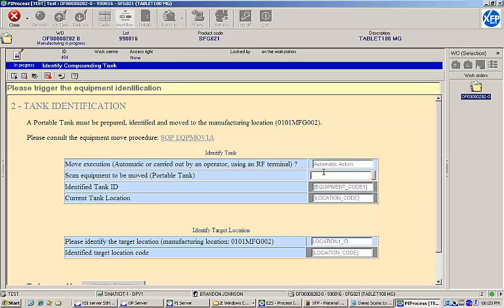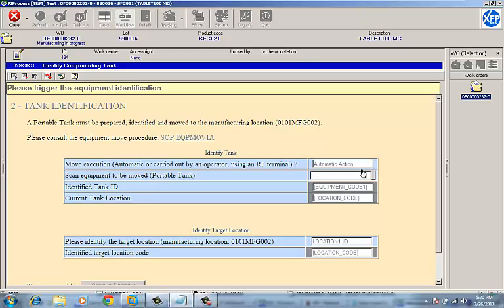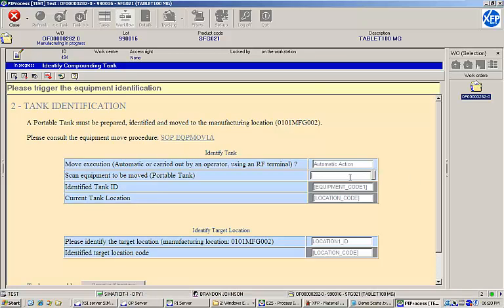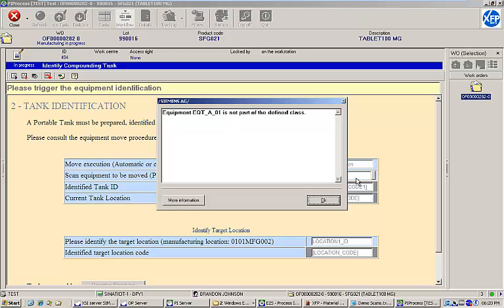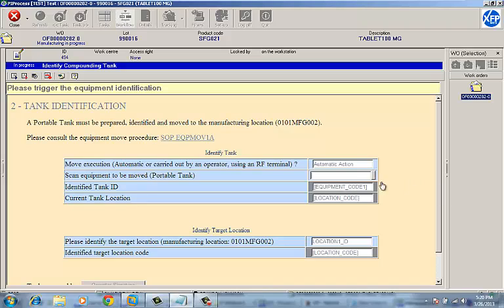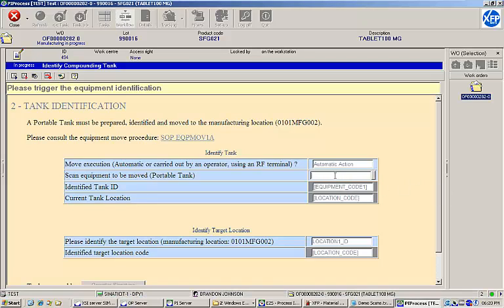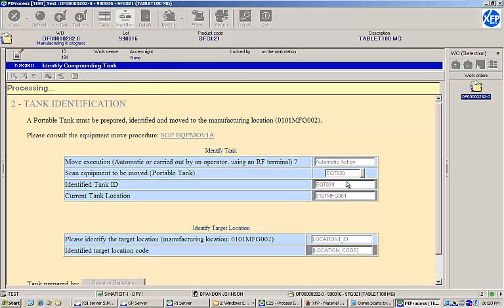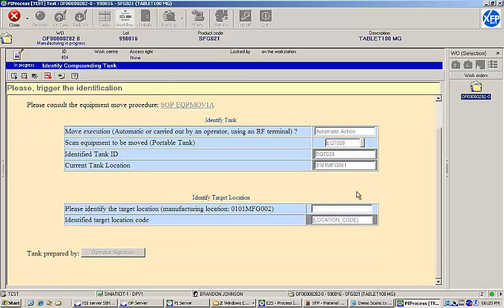Next, I'm prompted to scan the ID of a portable tank to use for manufacturing. Note that if I scan an incompatible piece of equipment or one that is already assigned to another work order, the EBR will not allow me to continue. I'll select Tank EQT020, which should meet all of the requirements. Once I scan a suitable tank, its ID and current location are displayed and I'm allowed to continue.